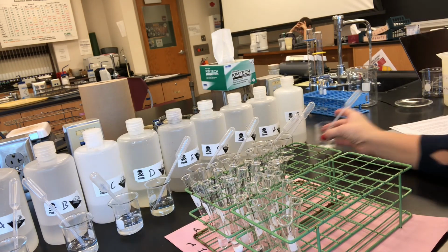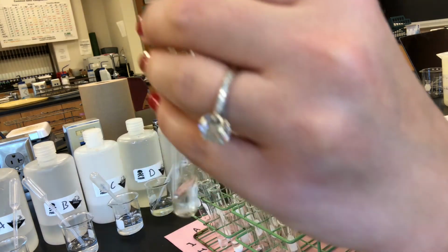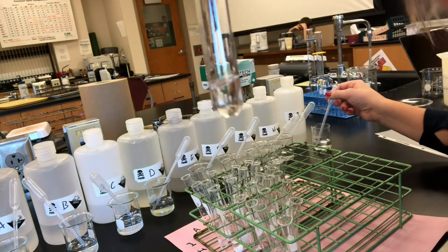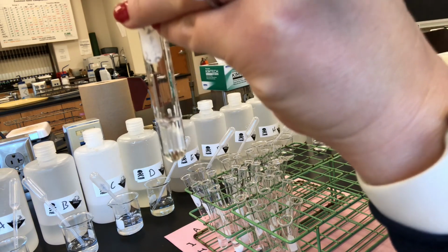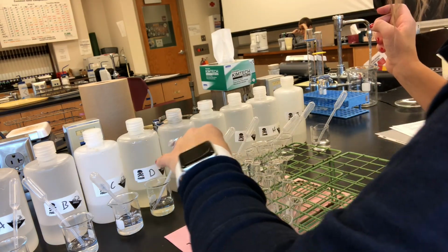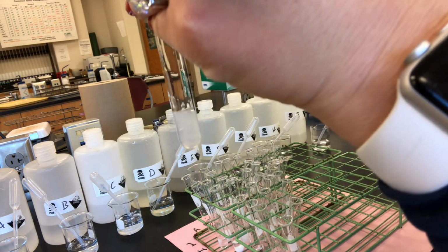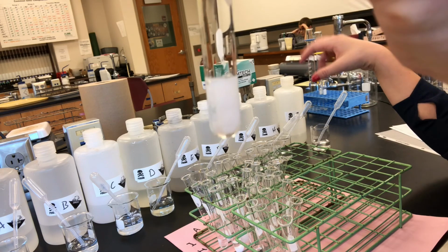All right, here we go. I. Oh, I was doing that. I want to do it this way. All right. B, or no, we are on C. C and I. No change. C and H. Got action. Precipitate formed, white precipitate.